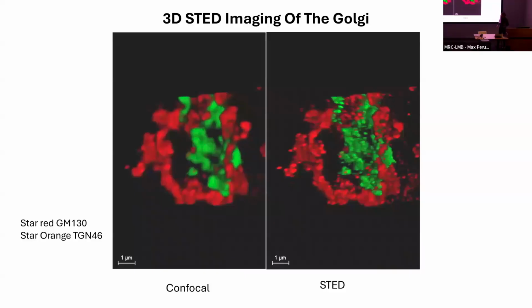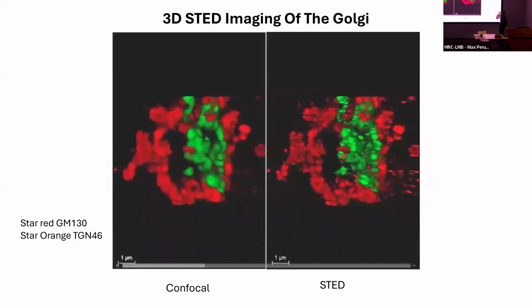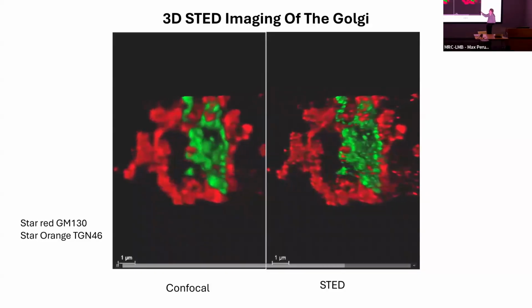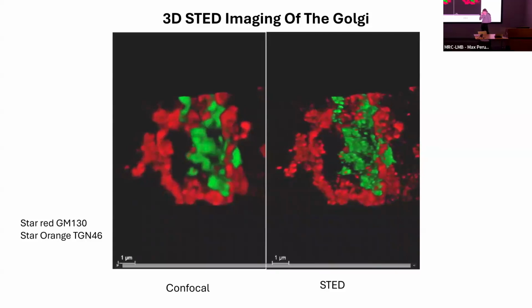What do you get out of this confocal? You can get some out of super resolution. You can get something like this. Now you say, okay, I know that's a Golgi, fine. What does the extra resolution get me? This is an illustration of the power of resolution.